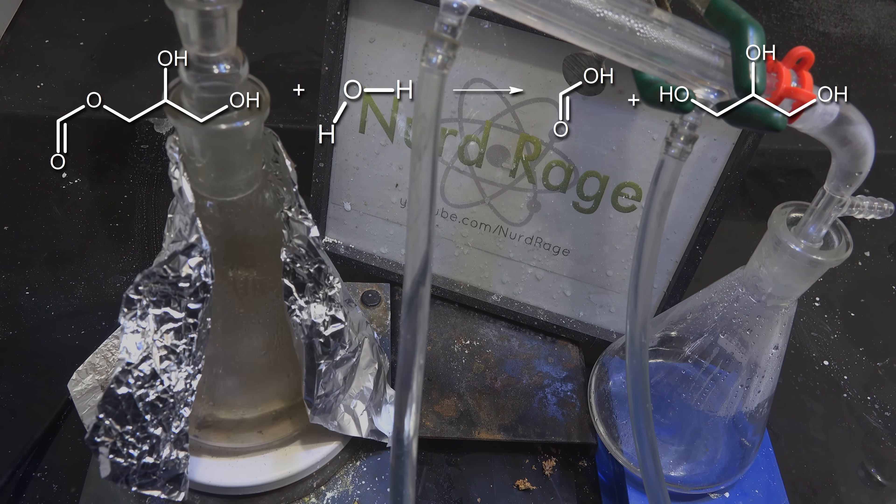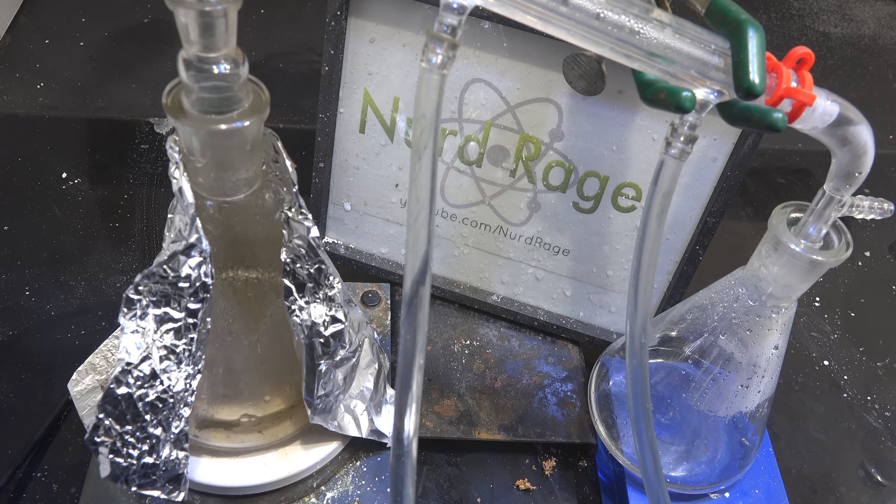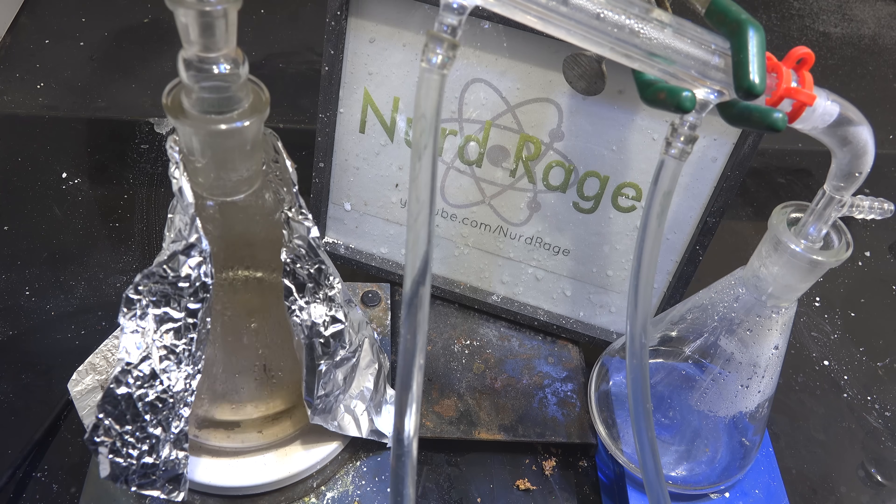Oxalic acid has water in it that will cause hydrolysis of the glycerol monoformate. The formic acid will now distill over. Essentially this step is where we're releasing and collecting our formic acid.